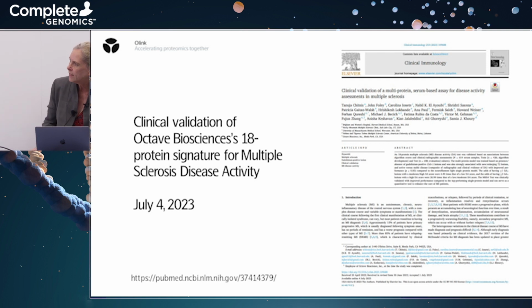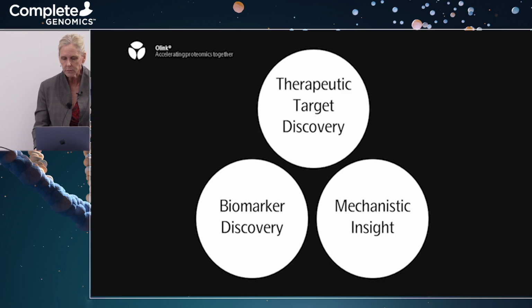And then this came out in July of last year. This was done through the Brigham and Women's team that independently validated the Octave Biosciences clinical application. So I expect that to show up as an LDT very soon.